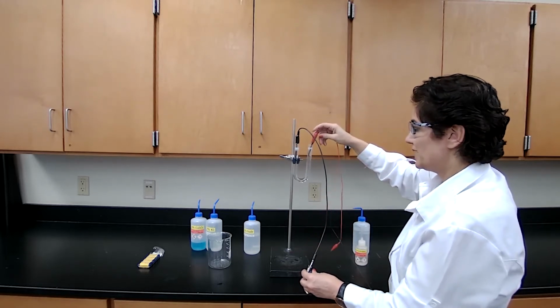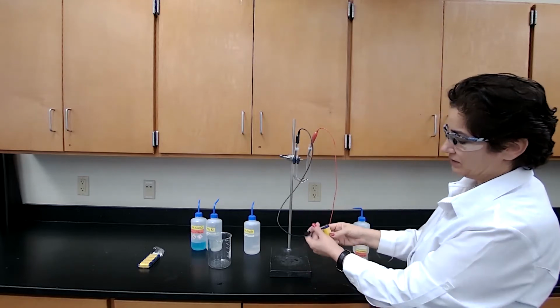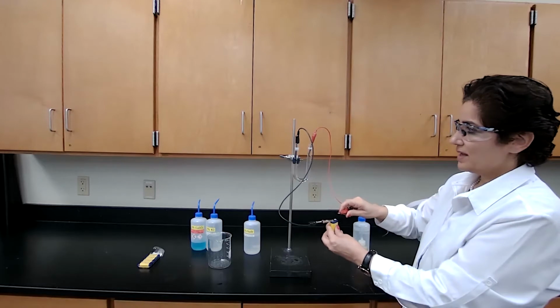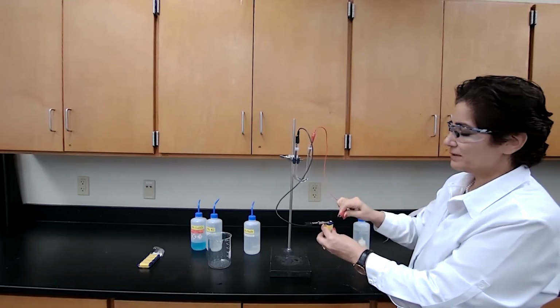Based on the chemical reaction that is taking place, we can determine which side is the cathode and which side is the anode. What happens on the cathode side is reduction, and oxidation happens on the anode side.